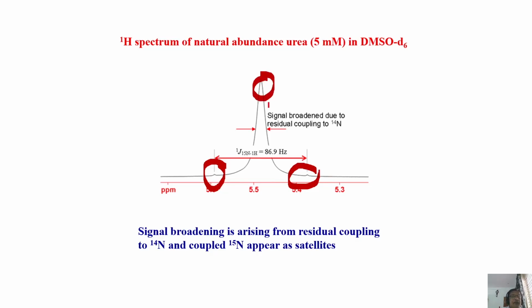The majority of the peaks, the strong peak, is coming because of the 14N attached proton, like carbon 12H and carbon 13H. This is the 15N attached proton. As a consequence it is very weak in intensity, and nevertheless, measuring the separation gives you the nitrogen 15 and proton J coupling. That information is easily obtainable.